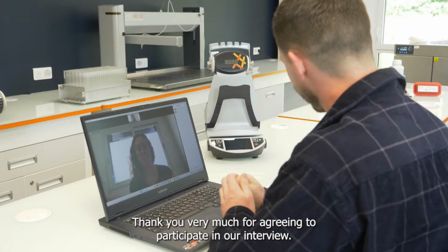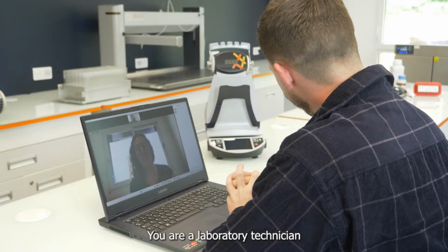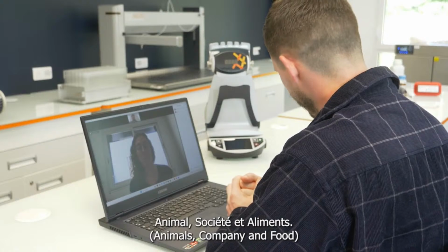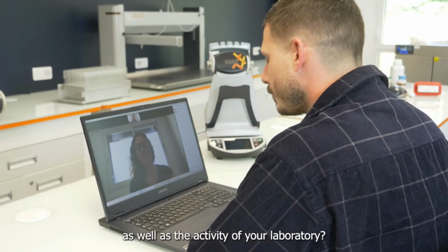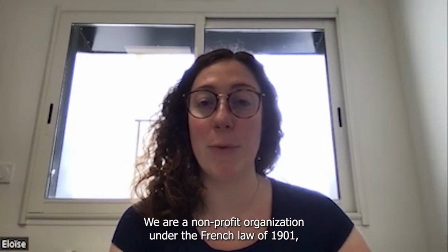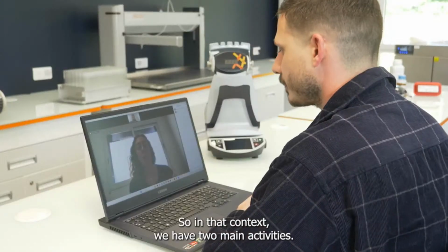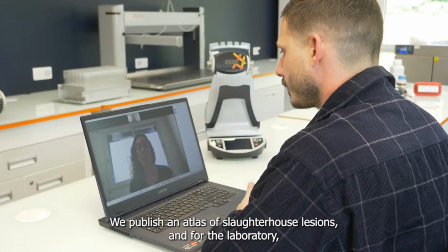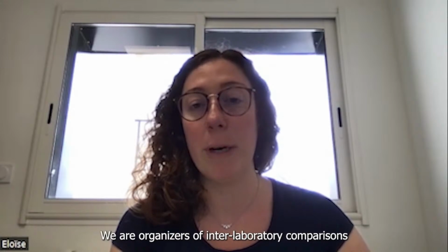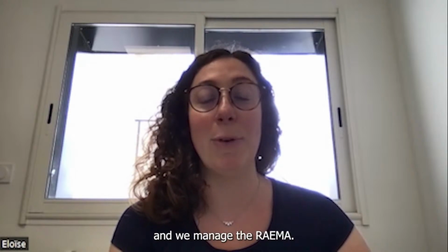Hello, Mrs. Riohel. Thank you, much appreciated, for agreeing to participate in our interview. Hello, with pleasure. You are a laboratory technician for ISA Association, which stands for Animal Society and Food. Can you introduce us to the activities of your laboratory? Yes, I have been a laboratory technician at ISA for 10 years. We are a non-profit association working in the field of veterinary public health. In this context, we have two main activities. We publish an atlas of slaughterhouse lesions, and for the laboratory, we are the organizer of interlaboratory comparisons. The ASA is accredited 17043 in this field.